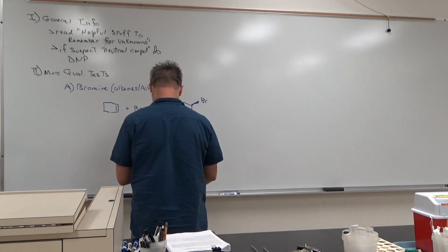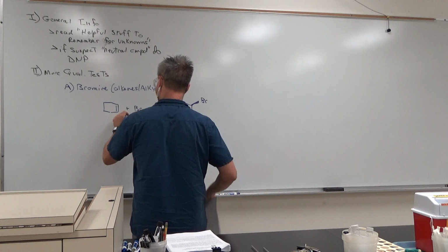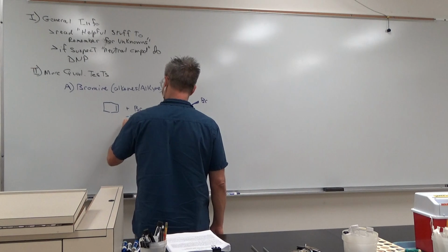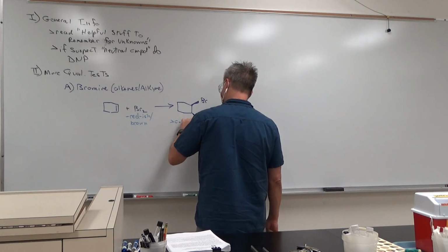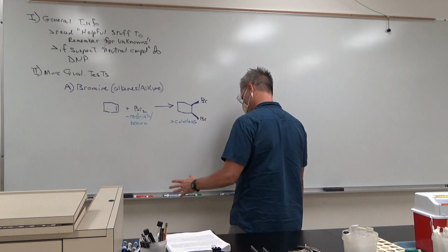So this is reddish brown, okay? And this is colorless. All right. Okay, so how does this happen again?